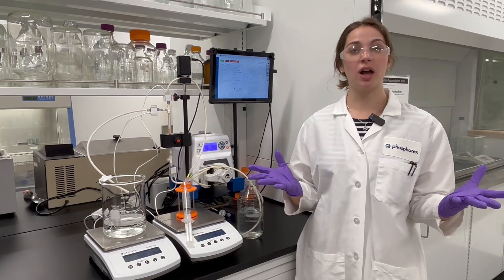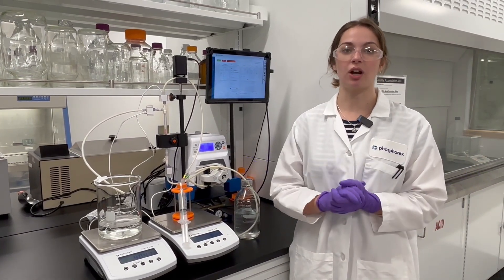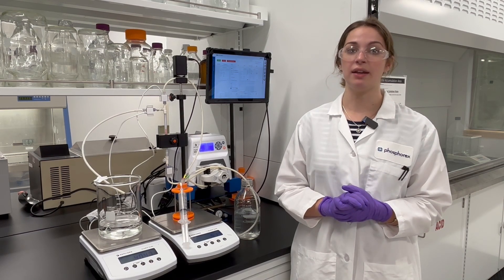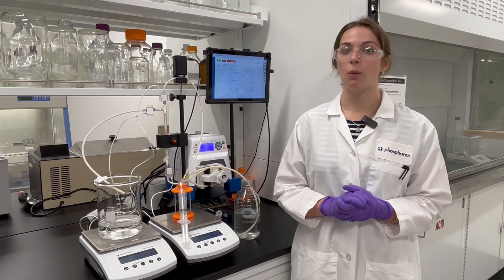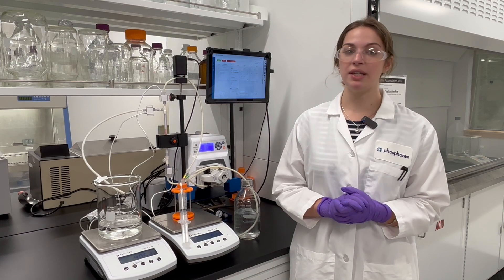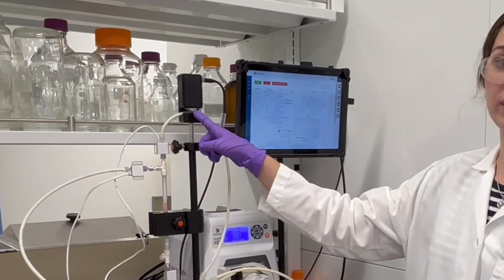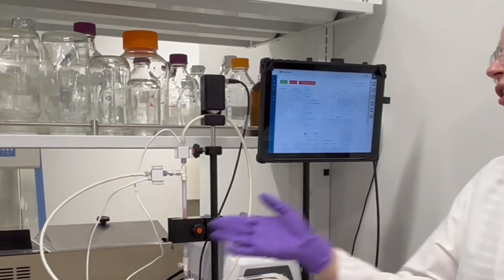With the optimal concentration now selected, TMP excursion experiments are conducted to identify the optimal values for feed flow rate and TMP that maximize the permeate flux. While operating diafiltration, TMP is increased using an automated back pressure valve that restricts the flow of the retentate, and the impact on the permeate flux is observed.